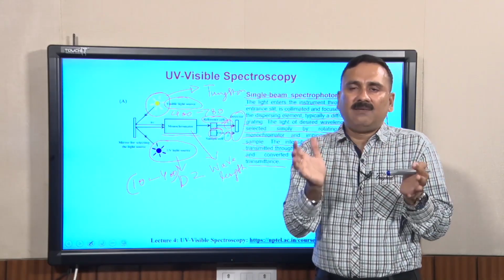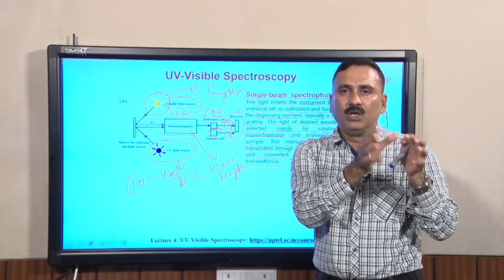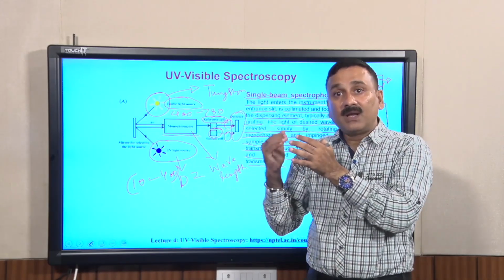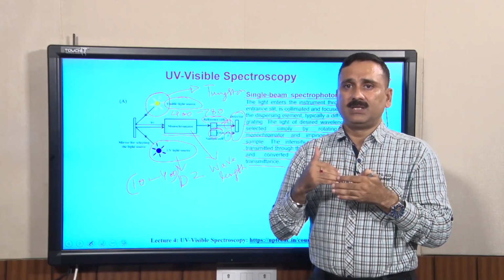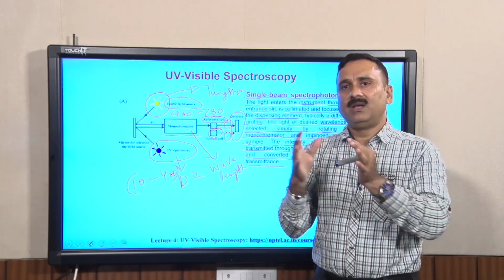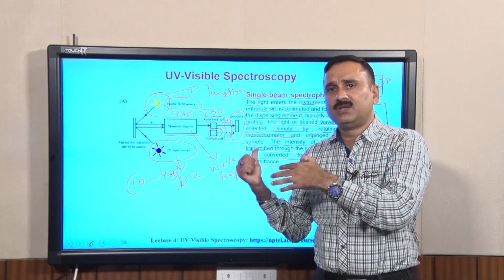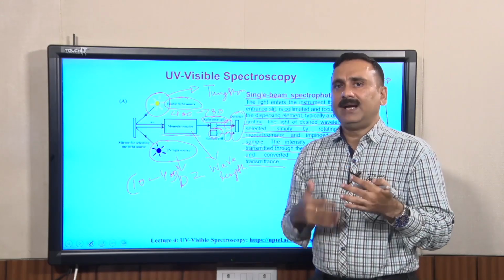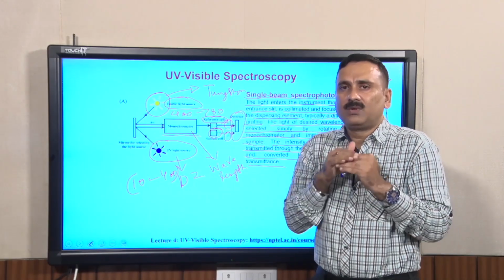For example, at time 0 the water is showing an absorbance of 0.2, so the 0.2 becomes 0, but at time x if the water absorbance itself is 0.3, then there will be an error of 0.1 unit. That could be very significant if you are calculating the concentration of that particular protein using UV-visible spectroscopy. It is going to be a major problem.